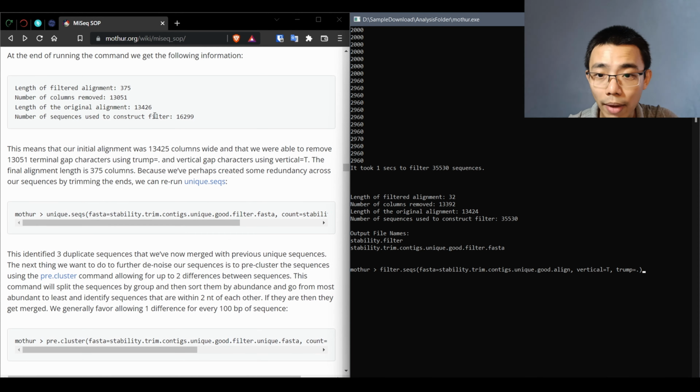Well, it could be the sequence where I tried to not trim the end, though. So never mind, let's see. So far I don't have to run this. This one I already ran. Let's just align it again and see if the alignment generates something completely different. Okay, so that looks fine. It doesn't look completely wrong. Let's just trim it with 1969 and 11551. I'm missing a bracket.